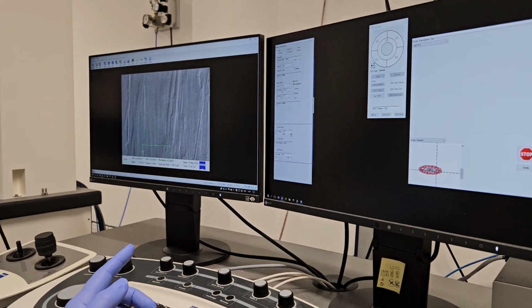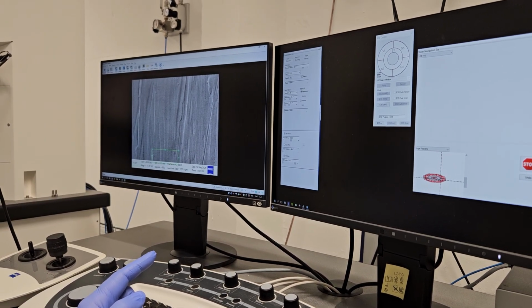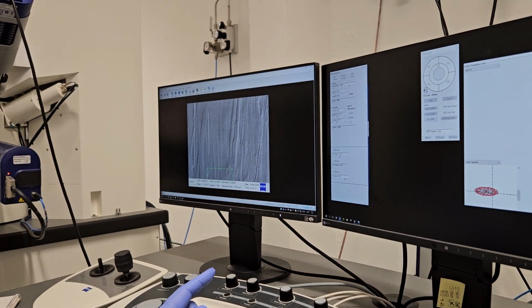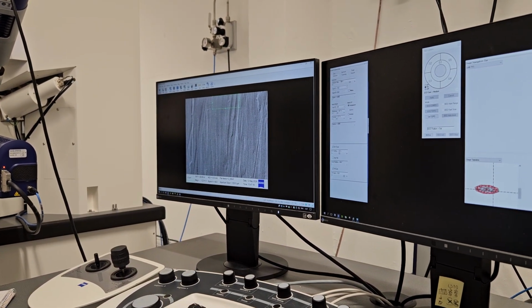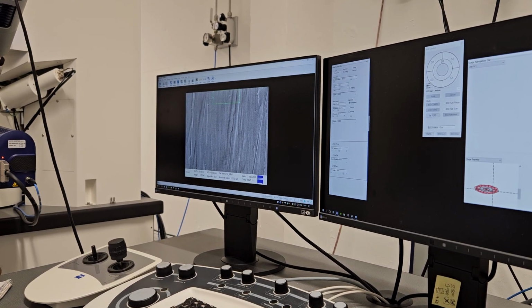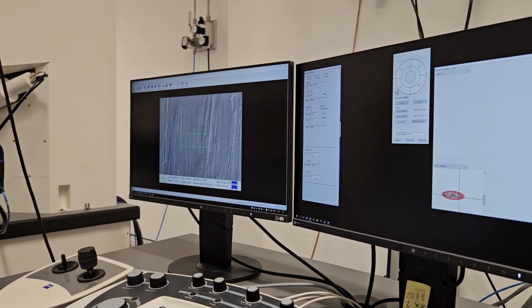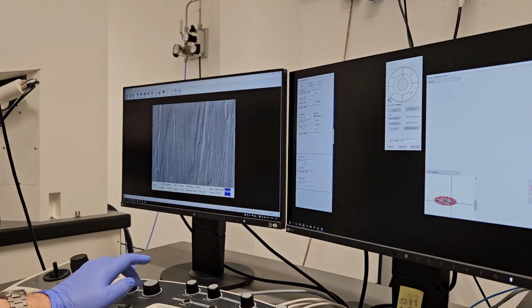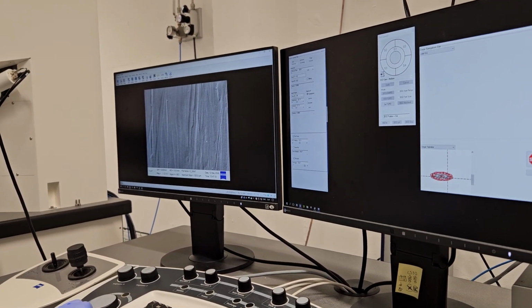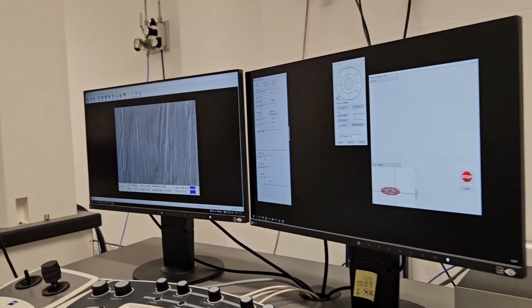I would recommend that you slightly adjust, usually it's positive. You should do it in both, bottom and top, or only in one of them. Imagine if your sample is not perfectly flat, then it's a good idea to check both top and bottom. So you focus in the center of the sample, and then you use dynamic focus for top and bottom, only if needed, when it is tilted. Otherwise, it doesn't make sense.